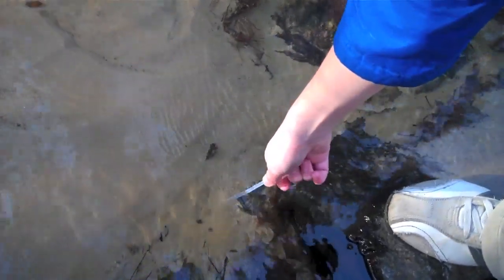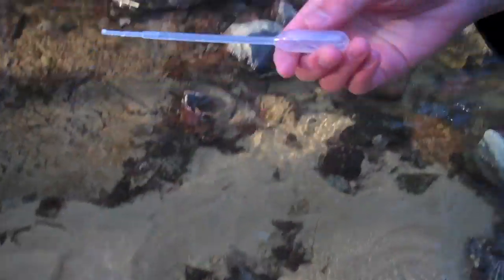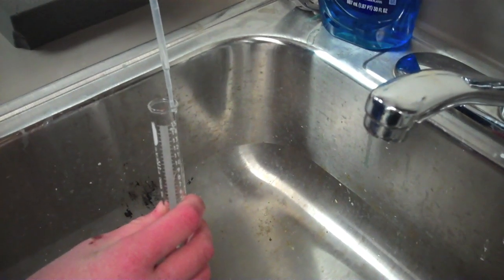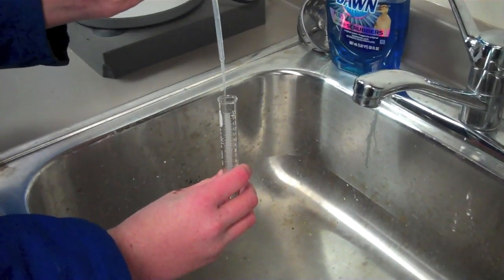The first step is to collect water from a natural source such as this creek. Next, place 1 to 5 milliliters of water into a graduated cylinder.